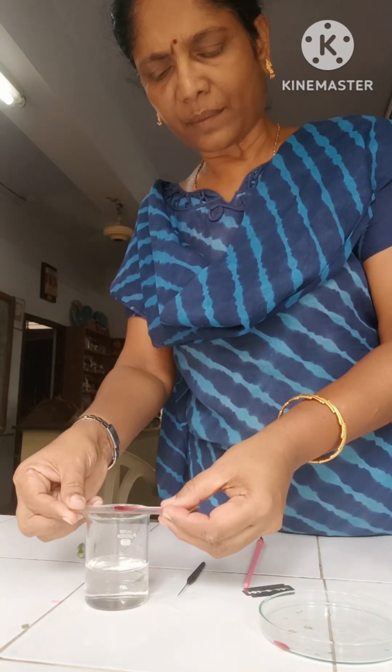Now the slide is ready. It can be observed under the microscope. It has been kept under the dissecting microscope, children. Can you observe small dot-like structures? They are the vascular bundles. Here the vascular bundles are scattered. In monocot stem the typical feature is scattered vascular bundles.